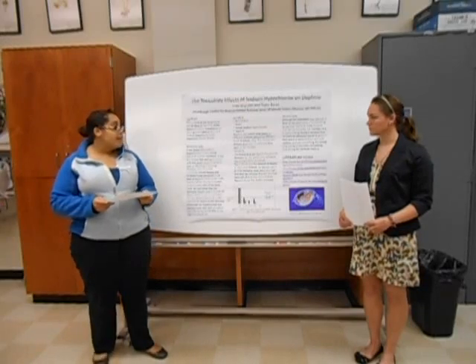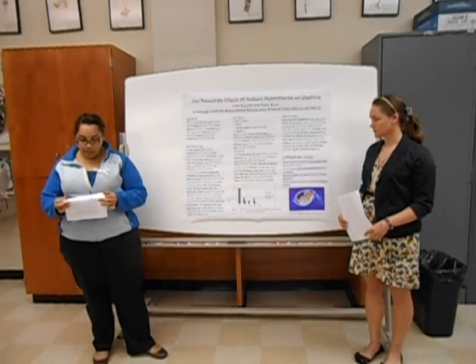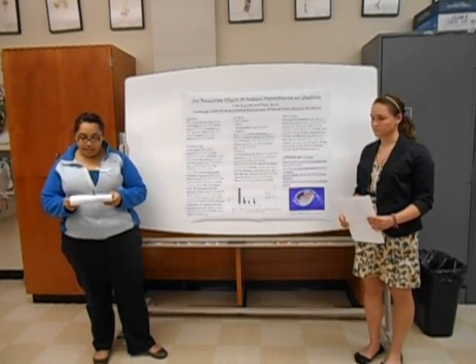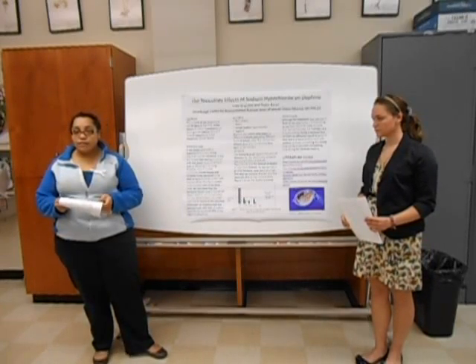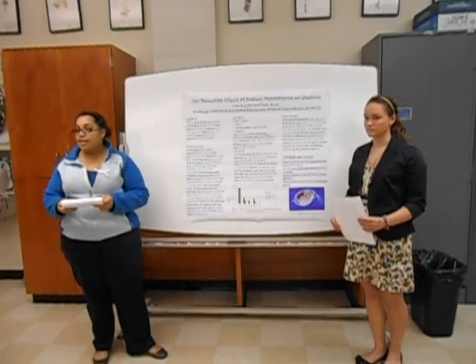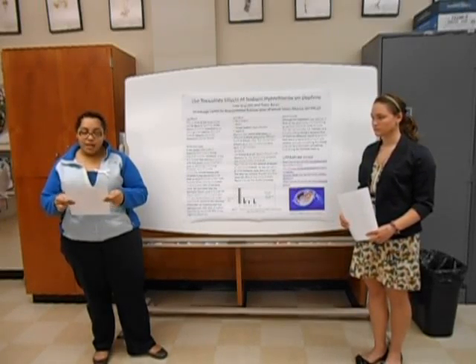So our materials and methods. We used 5 petri dishes which were labeled according to concentrations, and initially we had 0%, which was our control, 5%, 10%, 15%, and 20%. But we changed these after our first test. Next, we collected the Daphnia using a small pipette, and in each petri dish we put around 10 to be tested.